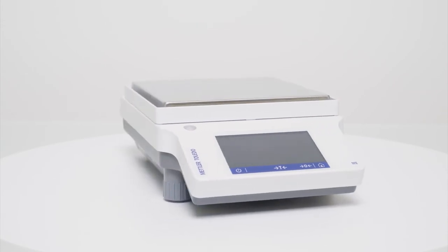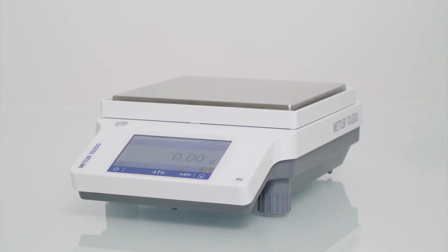MET balances are designed to last. They have a robust construction metal bottom, durable components and overload protection.